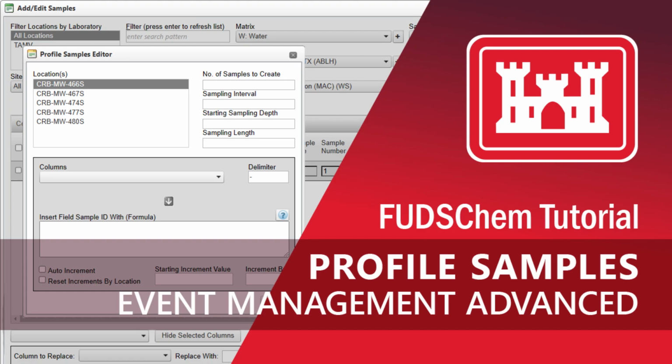This video will go over how to use the Create Profile Samples button to automatically create contiguous profile samples in FUDSChem's event management tool.